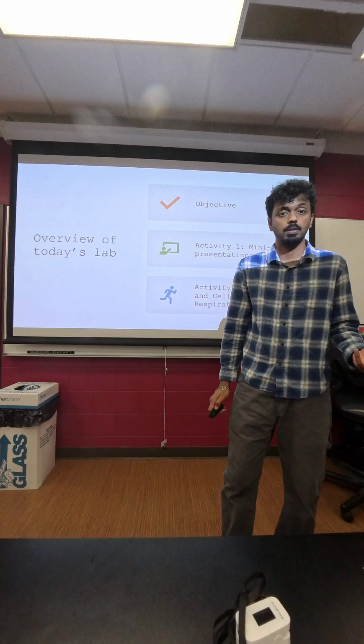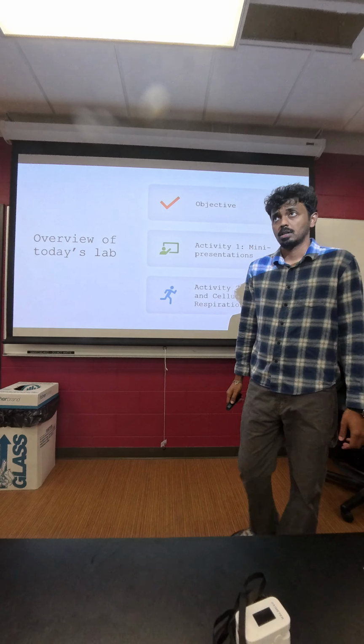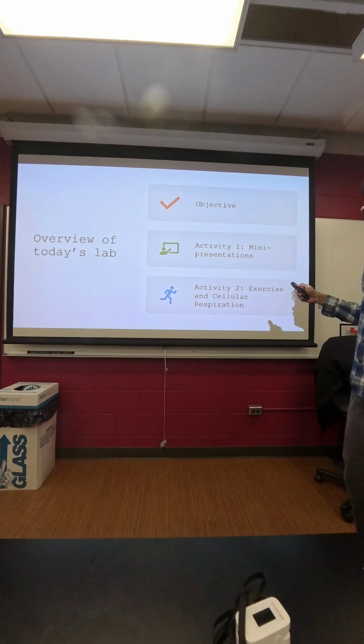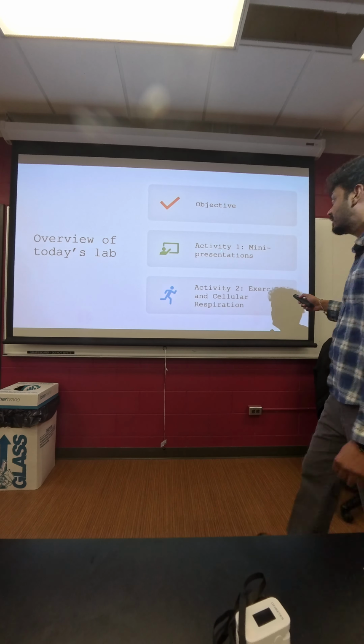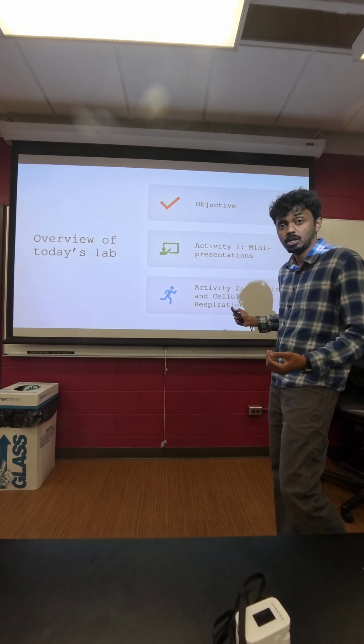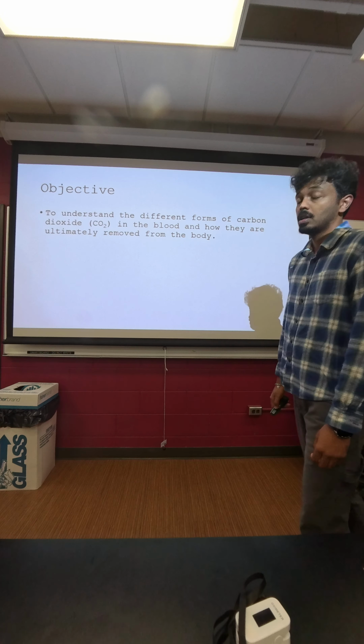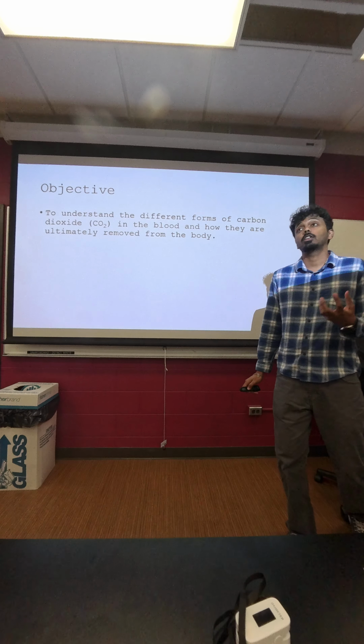So today we will be learning something about the different forms of CO2 in the cellular and the pulmonary respiration. Overall, the view for today's lab is we start with defining the objective of this lab. Then we go ahead with the mini presentation where I'll delve deeper into the different forms of CO2. And then we have an experiment which defines the different roles of CO2 in cellular respiration. So let's get started with defining the objective.